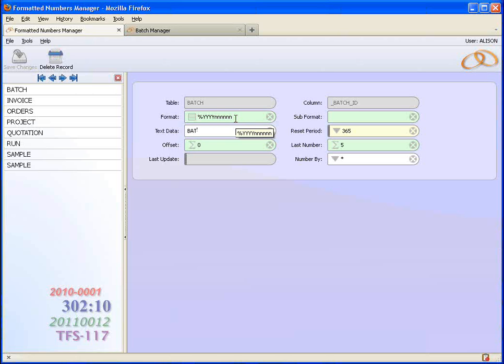Presumably because I didn't put that comma in, I could do it like that. I don't know, X. So that means it would all end with an X. So you wouldn't necessarily want to do that, but you might want to put some sensible text in there.